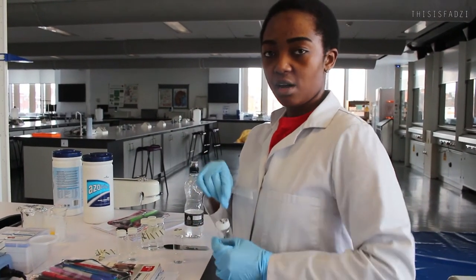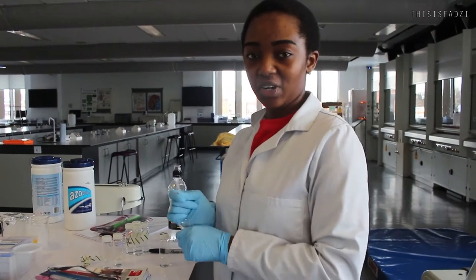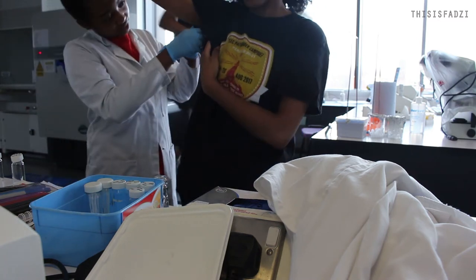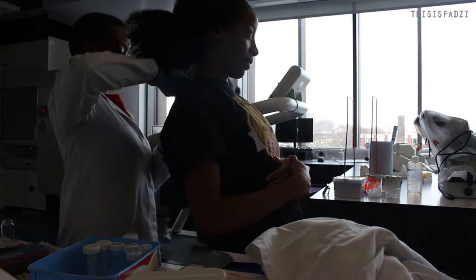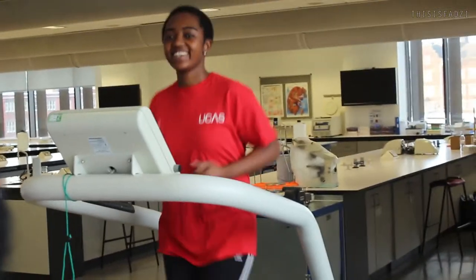So right now I'm gonna take the swab of Fadzi's armpit — we're not showing that — and her back, and then just put them in this, because it helps to keep the bacteria just swimming free. Anyway, I'm back. I'm Cheza. See how she's running now? She wasn't running before, and this is her experiment.